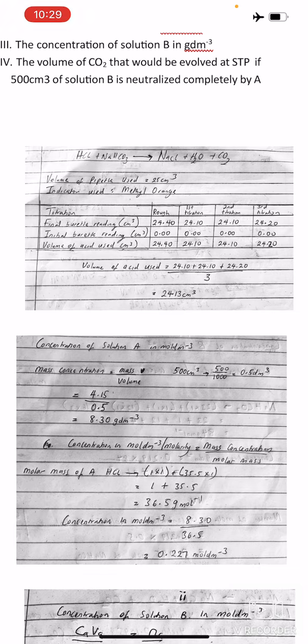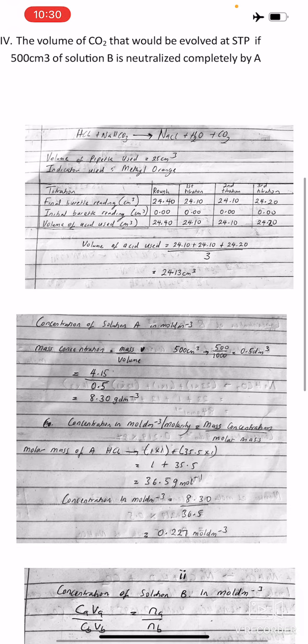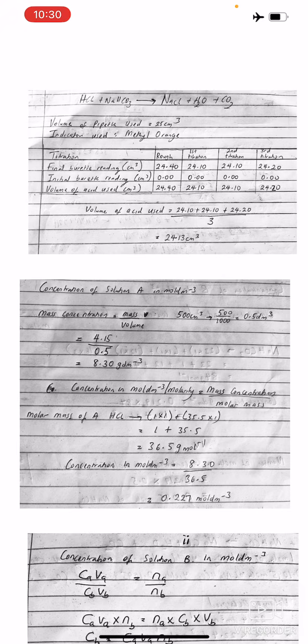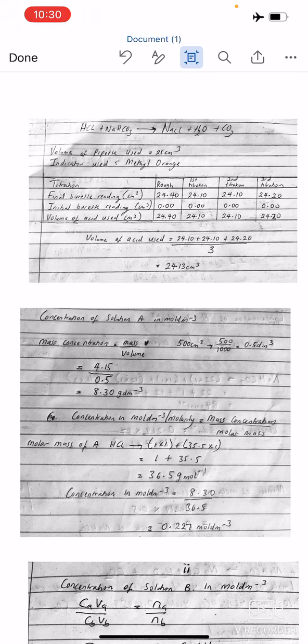Let me say it again. It is not general. Do not use this one. Ask your chemistry teacher. It is the value of your own school, and then you work around those values, because it's very important. During your WAEC exam on Tuesday, your teacher will be given a report form, and in that report form, your teacher will have to write out the school titer value, and your work must be within that range. In fact, most especially plus or minus 0.1 or plus or minus 0.15 of that range.